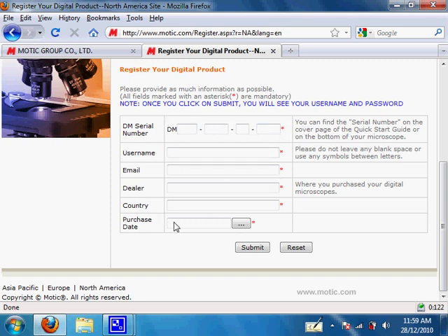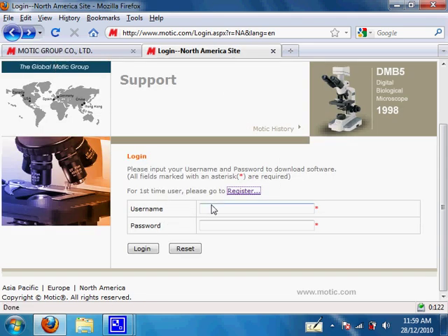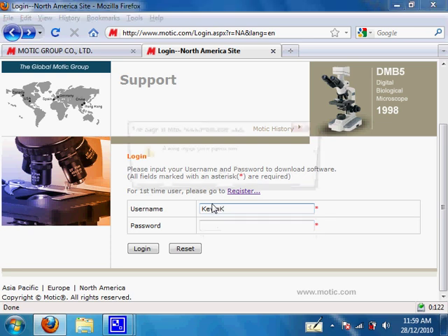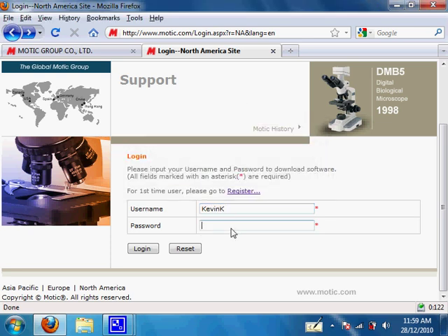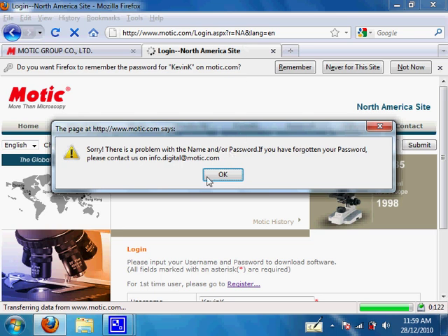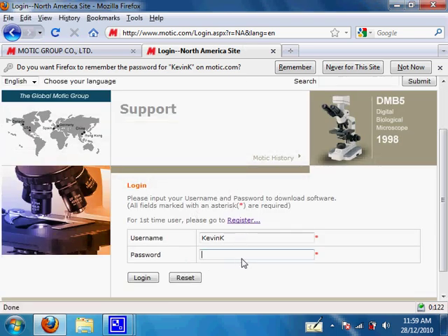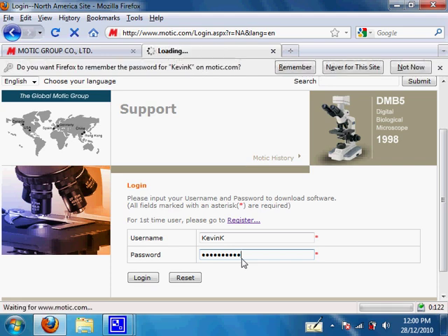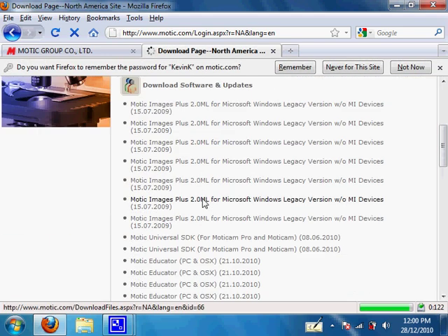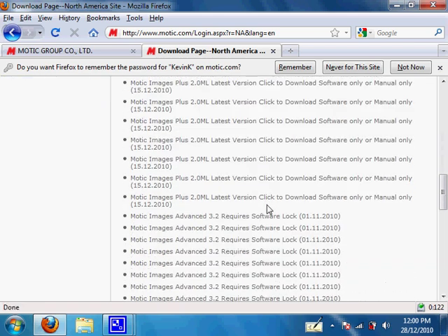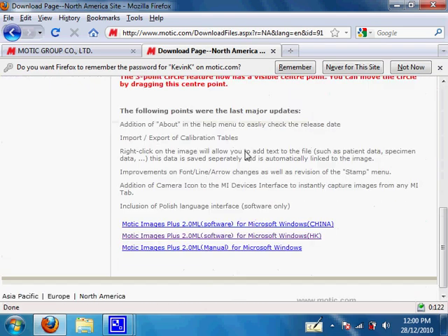Fill in all the other fields and you should be able to get a login with a username and a password. Since I already have mine, I will not register again — I will type it in now. It should pop up the download page again; the one we want is Motic Images Plus 2.0 latest version.